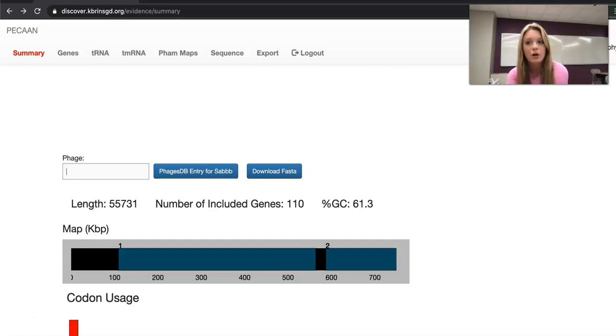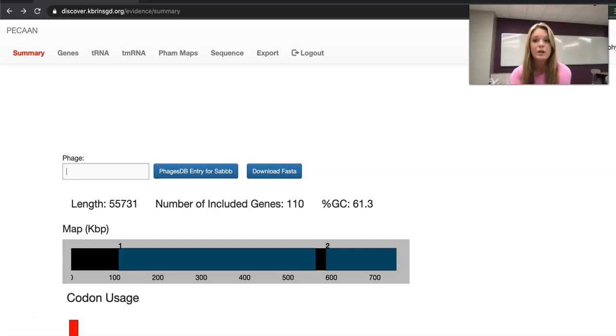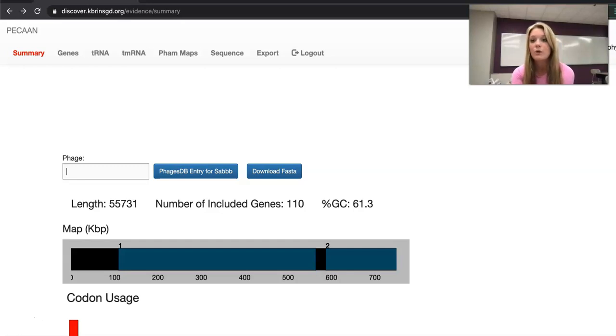It's similar to a Google Doc or Google Slide where people make notes on Pecan, save their work, and then it'll show it for everyone else that has access to Pecan.